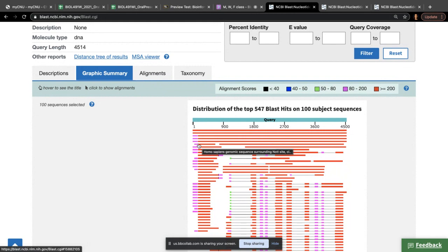Oh, well, it says genomic sequence. So you don't actually know if it's a gene or not. Whenever it says genomic, it means that it could be a gene, it could not be a gene, we don't know. And when it says predicted, it means that we think because this is similar to that sequence, it may do the same thing, but you don't have biological data, you don't have that mRNA from the lab to know.